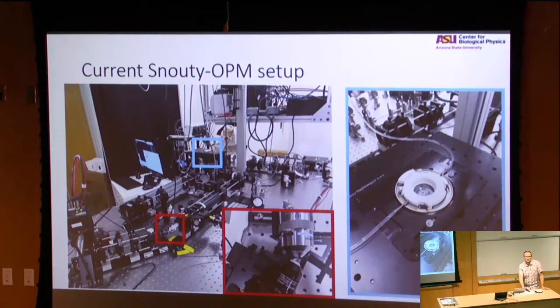Depends on how many photons you have. If you have enough photons, you can run the DMD at 9,000 updates per second. There is no fluorophore that is going to give you enough photons to avoid this noise-dominated issue. So why is it advantageous?